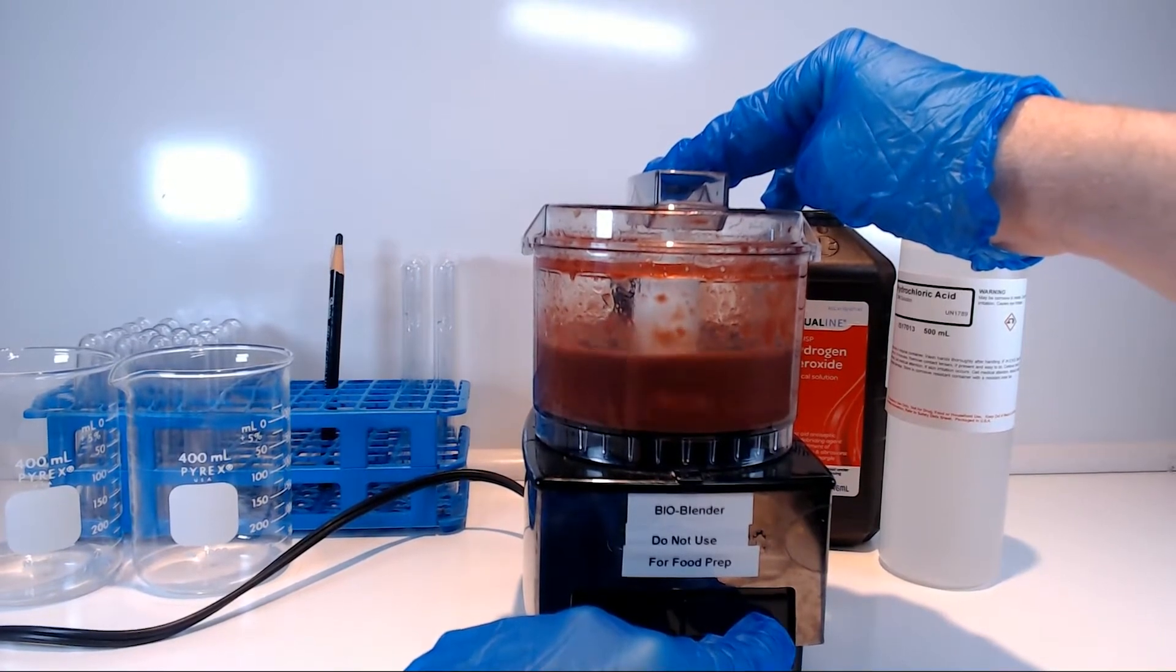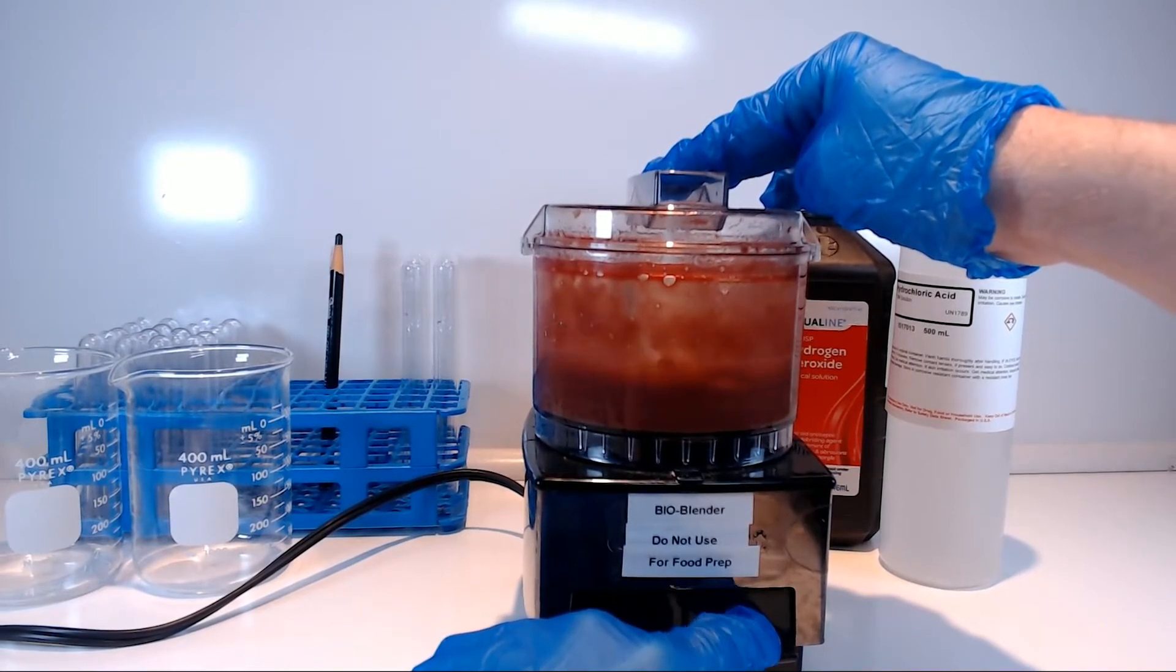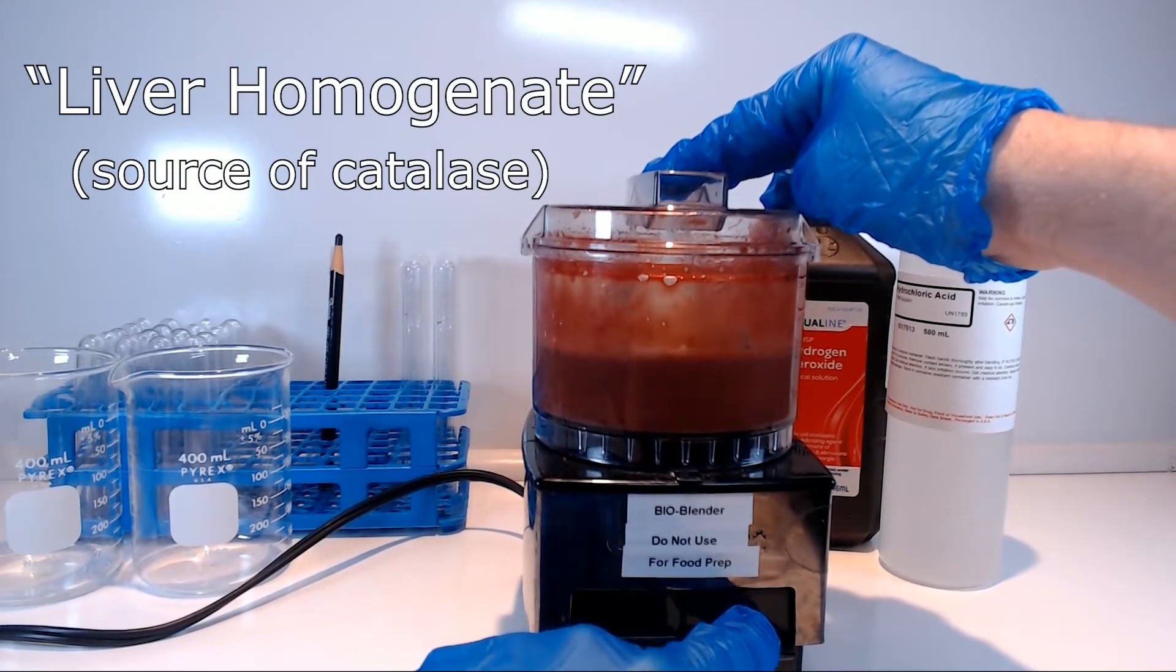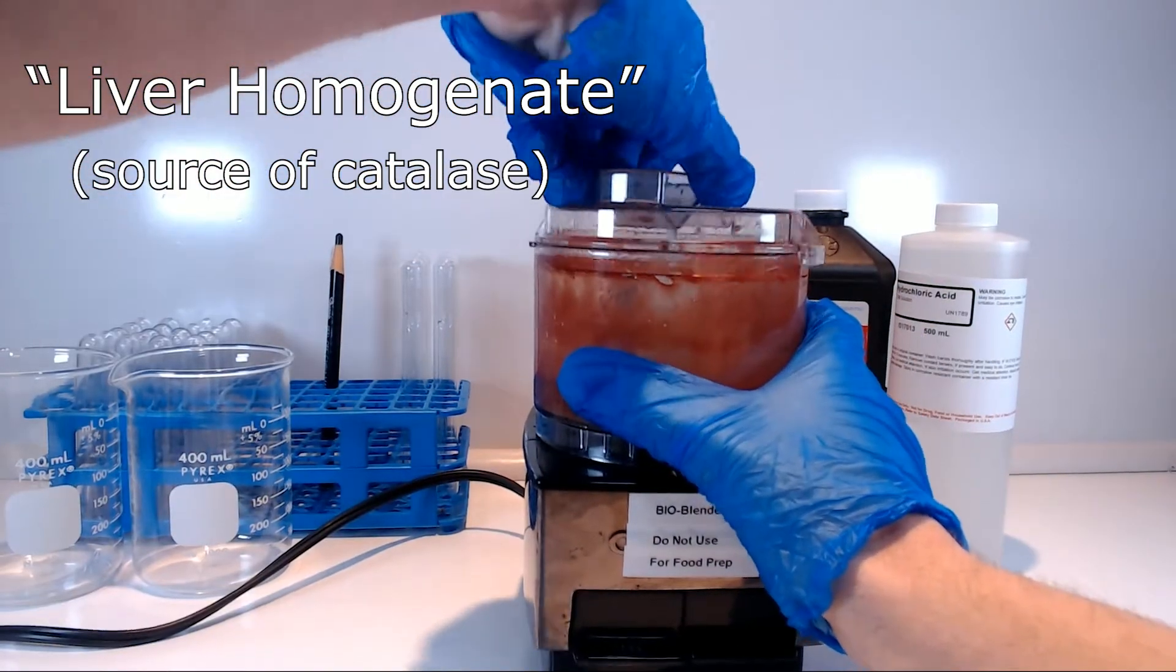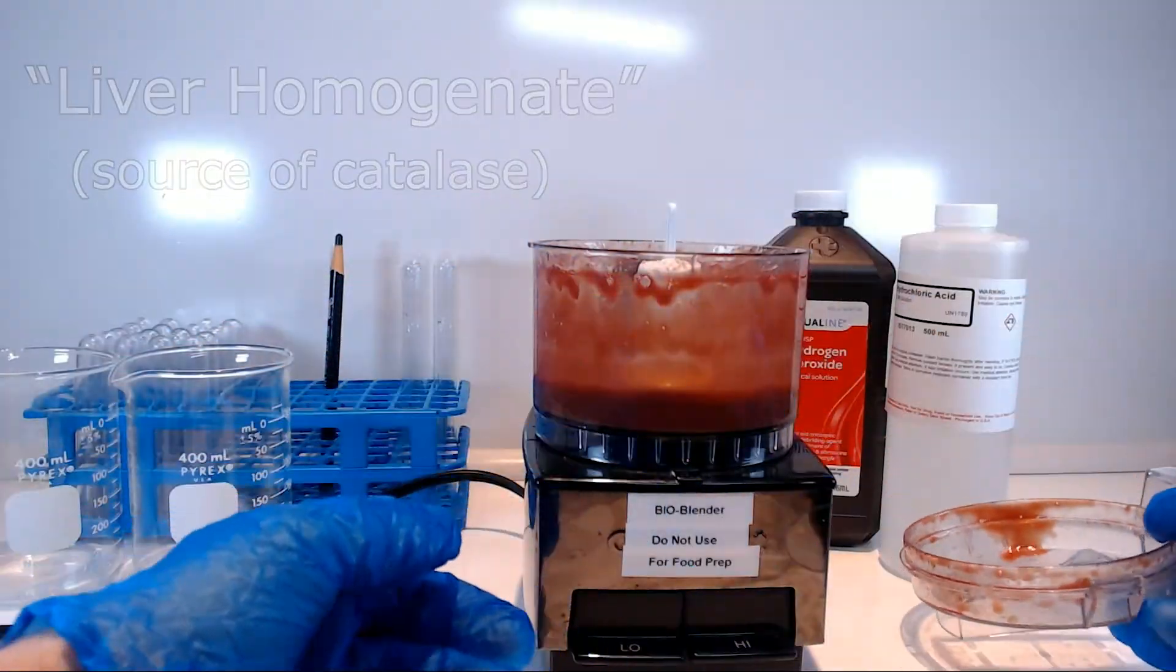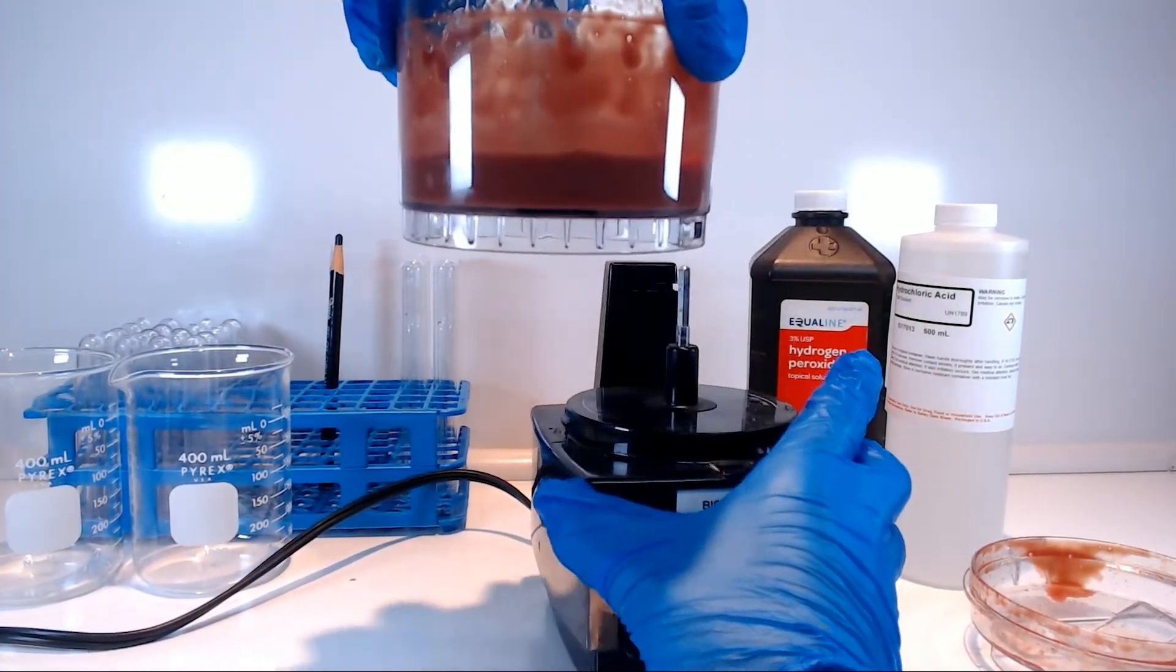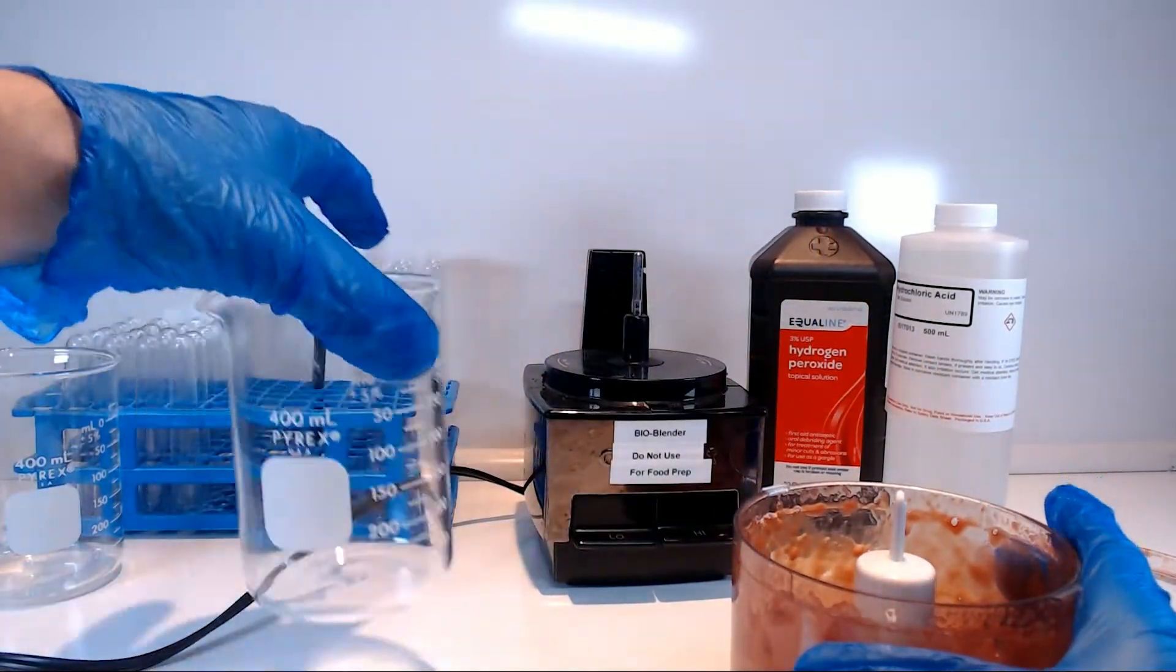Cutting up the liver into tiny pieces maximizes the amount of surface area that we have from the tissue in contact with the hydrogen peroxide in solution, and pureeing it into this liver homogenate solution is taking that idea to the furthest possible extreme. It also gives us the additional benefit of being able to deliver a precise volume of liver homogenate to each test tube, so that for each reaction we are delivering exactly the same amount of enzyme in all of the five situations we are going to be testing.